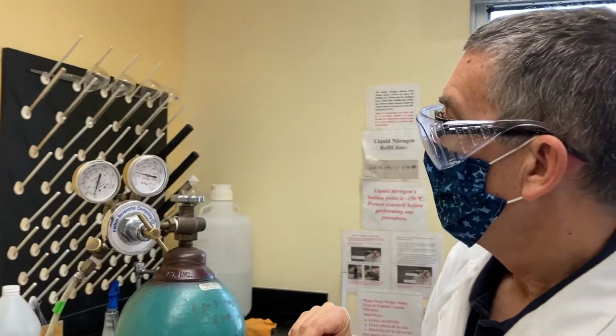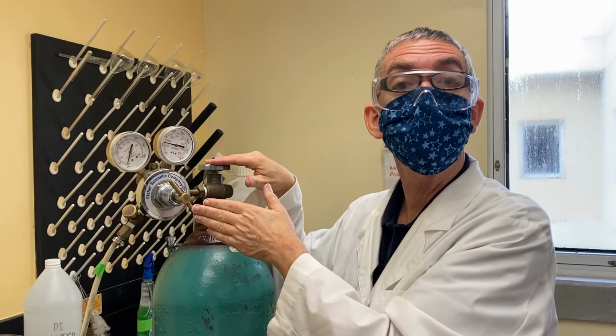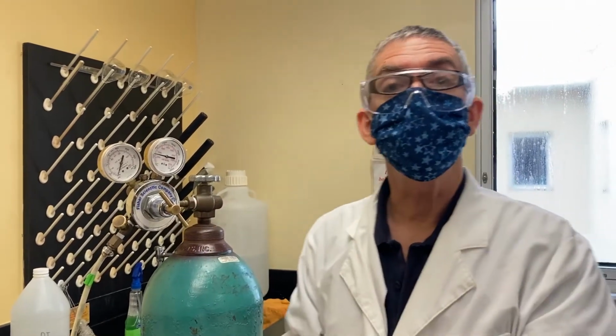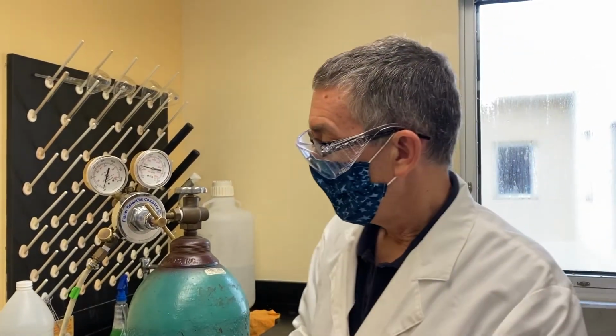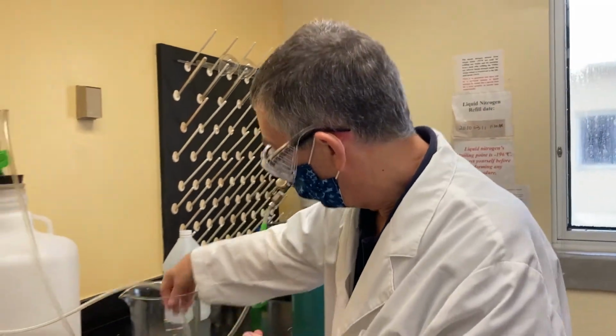Okay, so I think the first thing you should do is become comfortable with the gas regulator. Once you're comfortable with this, we are now ready to begin the experiment. So I will start the experiment. I will first add water to here.